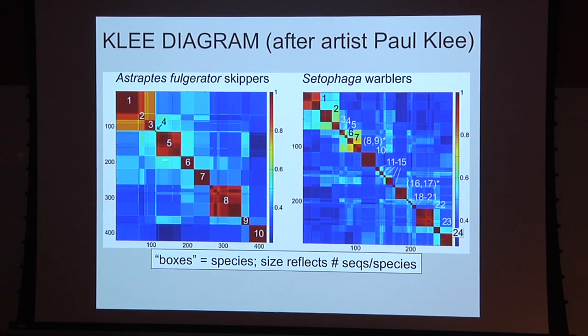These are about 50 sequences that are almost identical, like an island surrounded by blue water, because they're different from all the other 10 species here. These 3 are quite closely related, and some people have said these really should be considered one species. So now we have a kind of map, showing species as islands, similar among themselves and distant from what's around them.